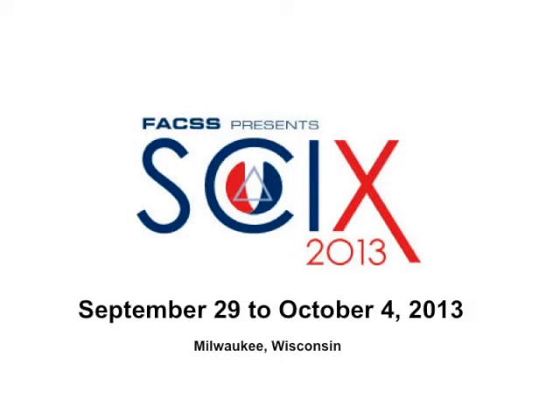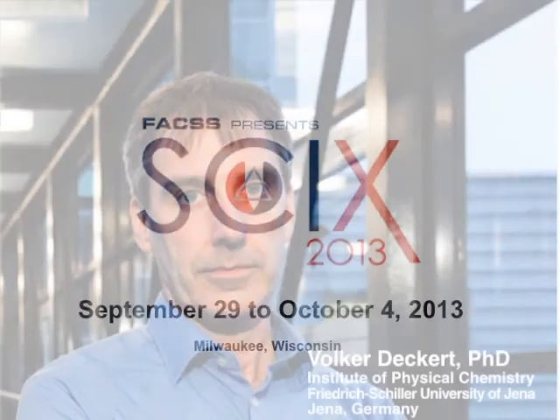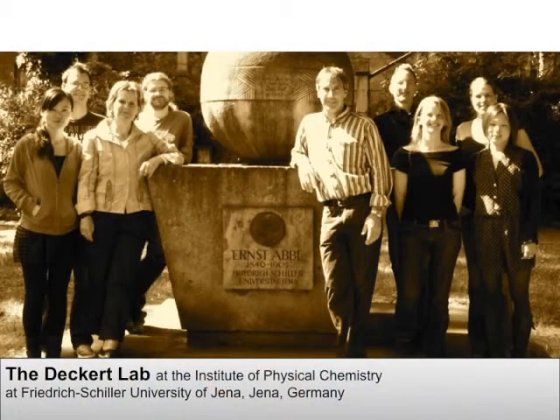Well, yes, of course. This technology enables us to answer questions that are not accessible by normal microscopy techniques. So they are much below the diffraction limit, so we can distinguish features in the range of a nanometer or at least below 10 nanometers. And normal Raman microscopy can do that down to a range of, let's say, 200, 300 nanometers in very optimistic cases.